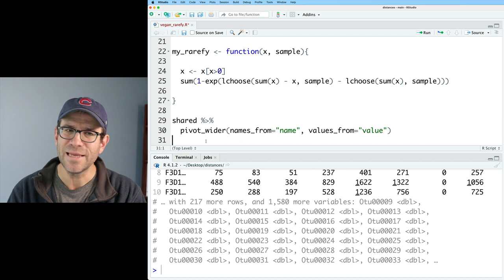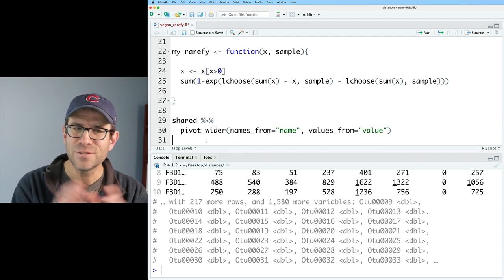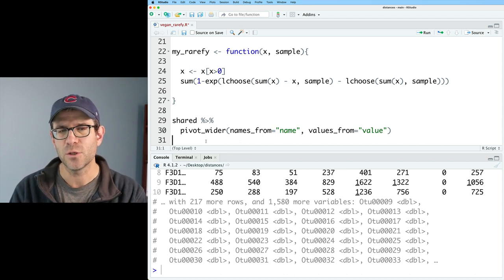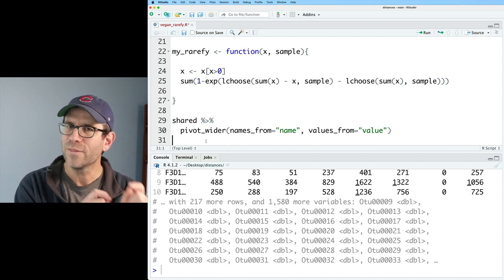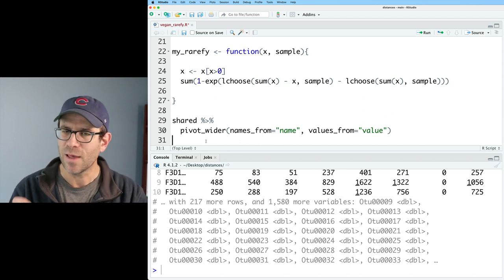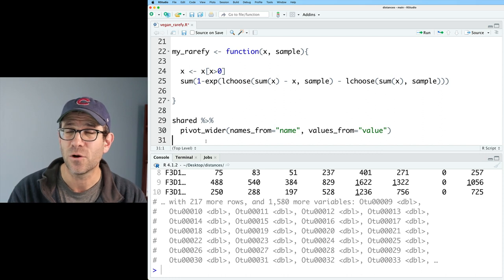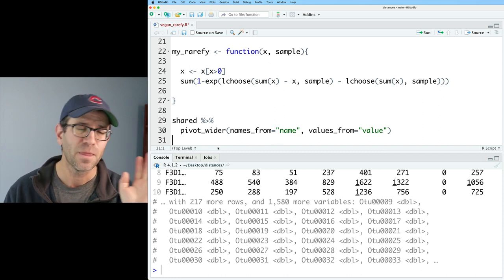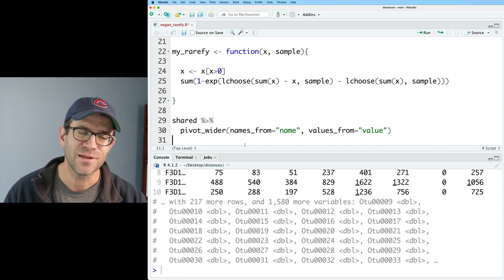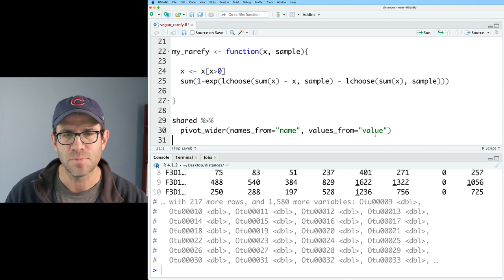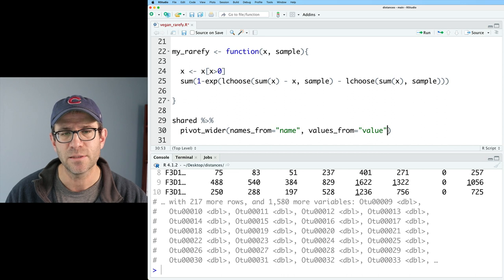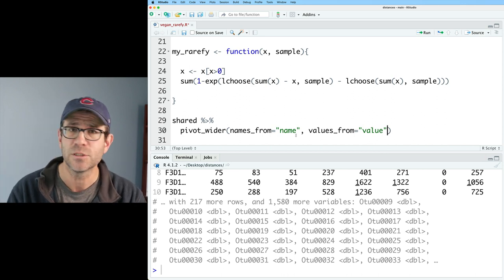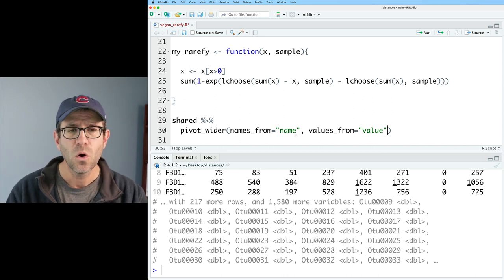And we will then do names_from=name and our values_from=value. I don't think we actually need those two columns names_from and values_from when the names are name and value. I think those are the default names that it automatically looks for. I like to leave it in there again to be explicit and to show you that if you have different column names, you can still do this pivot_wider.